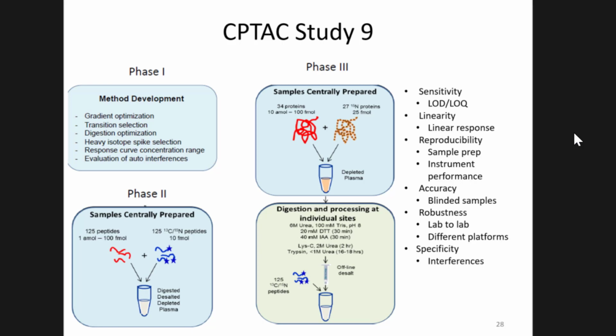So they did denaturation, reduction, alkylation, and so on. So we wanted to see the effect of sample handling. We wanted to see the analytical variability of looking at something that was already prepared and just had to be analyzed.